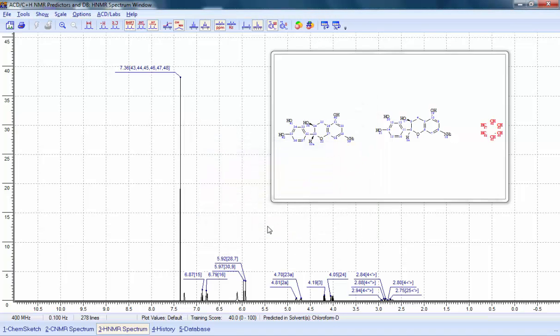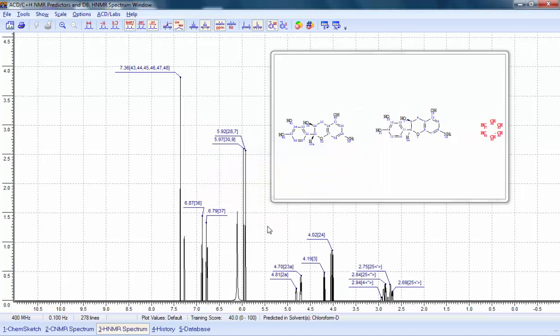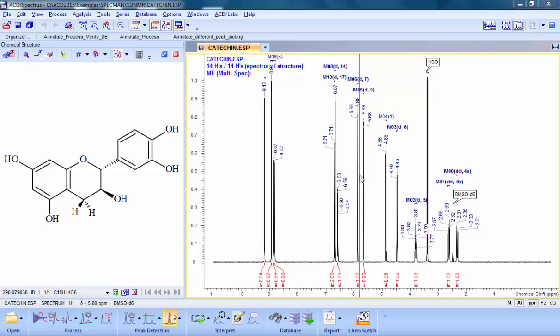NMR Predictors also includes the full processing and interpretation power of ACD Spectrus Processor, our all-in-one multi-technique analytical data processing and chemical characterization tool.